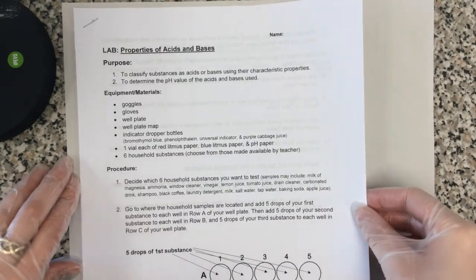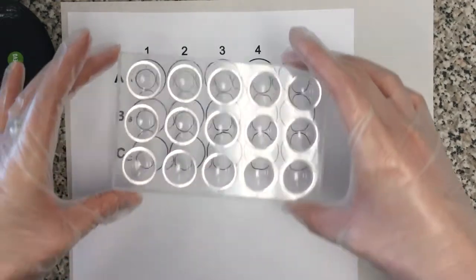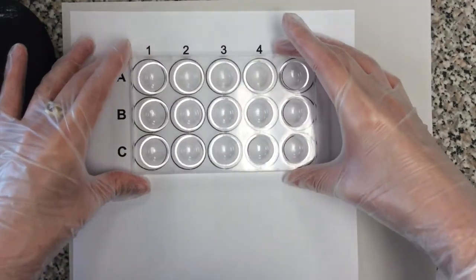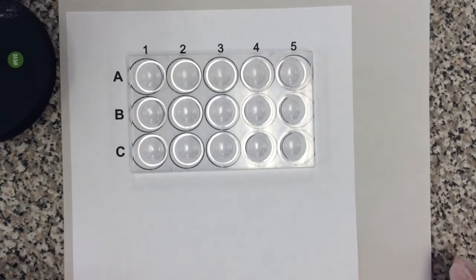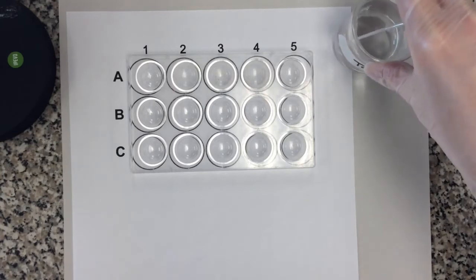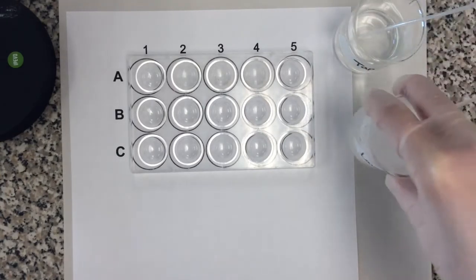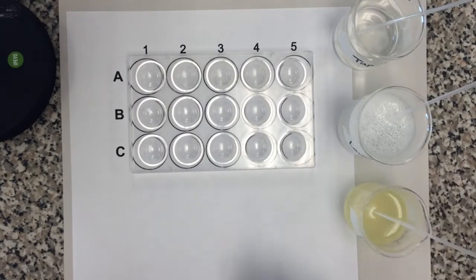So what we are going to be doing is using our well template and my well plates. They fit nicely over top. And I'm going to get a small sample of 3 of my unknown acids or bases. Let's pick for now tap water, laundry detergent, and some lemon juice.